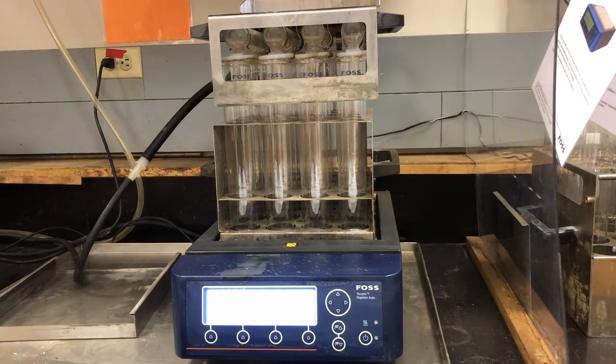You can see that it's only just starting to heat up now, so we put it on when it's cool and we let it heat up gradually. Once it gets to 420 degrees, we will let it run for probably 20-30 minutes until the sample is completely digested. And you'll be able to see when it's digested because we'll see a color change in our test tubes. So we'll see that when we come back.